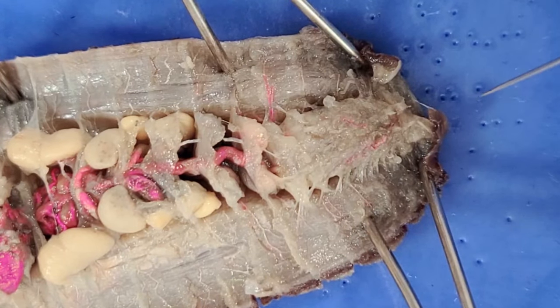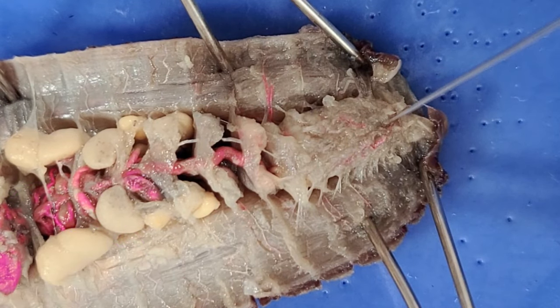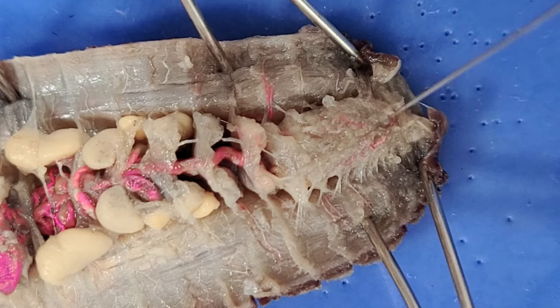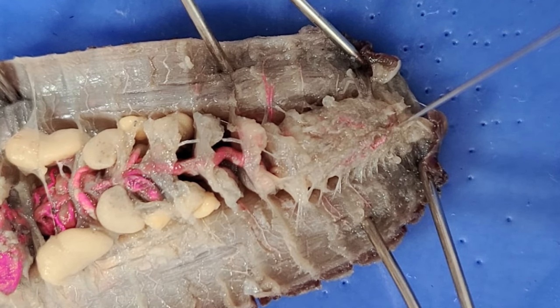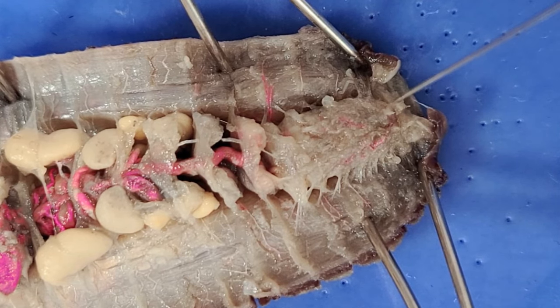Near the very end of the worm's head is the brain. It's very hard to see because it's very small, but you can see it has two lobes — one lobe here and another lobe right here. From the brain, a ventral nerve cord runs the length of the body, which we'll see later.